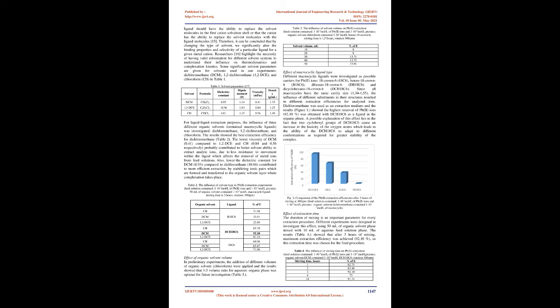FAAS measurements. Aqueous solutions after extraction and back extraction procedures were analyzed with flame atomic absorption spectrometry, using the calibration curve method. A blank determination was simultaneously carried out in a matrix solution of standards, 0.1 mol/L HNO3, and samples using the same procedure and measurement conditions.